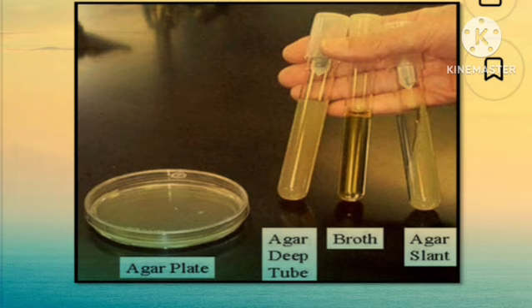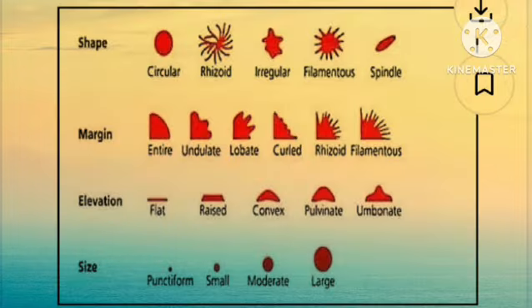So what are the functions, uses, and purposes of media? General purpose media contain nutrients. What nutrients are present? Peptone and beef extract, which support non-fastidious bacteria. For example, nutrient agar.